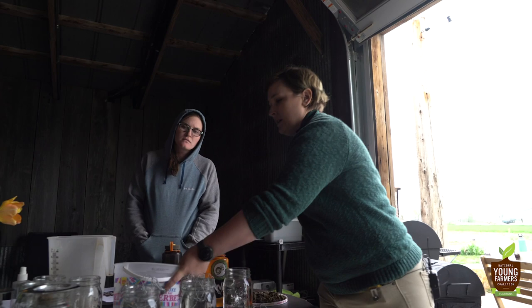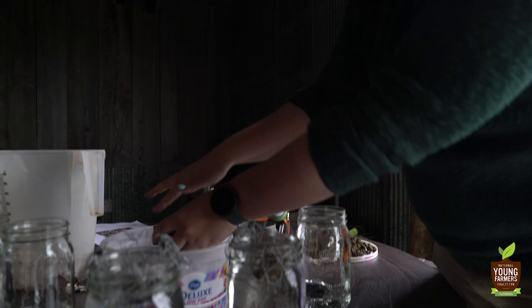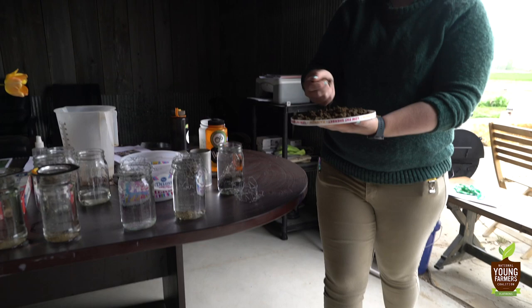So what we can also do, we're going to leave those there for a second. And what I'm going to do is, I kind of call this the quick water event. And what I'm also going to do, and this is just chicken wire stuck over glass jars, is put a few clumps in here, and we're going to leave these guys here until the end, and come back and look at them again. We'll do the same thing for our farm sample, which I'm pretty sure was under some cover crops. I'm not sure which one you grabbed. That's field 3? Yeah, field 3.